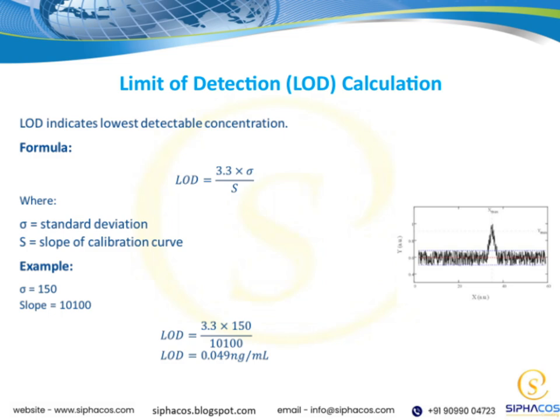We also use statistical methods, such as calculating the standard deviation of blank measurements, to make this process more precise. Connecting this back to our overall goal, knowing the LOD ensures that our method is capable of detecting even trace levels of our target compound, which is vital for accurate analysis and compliance. So, understanding how we calculate and interpret the LOD helps us validate the robustness and reliability of our analytical process.